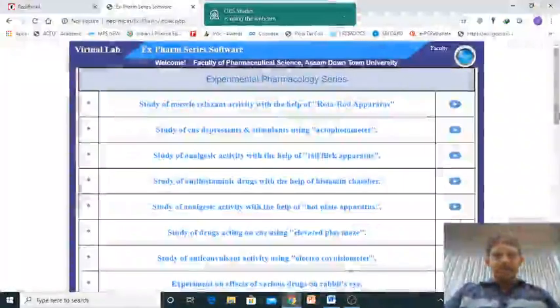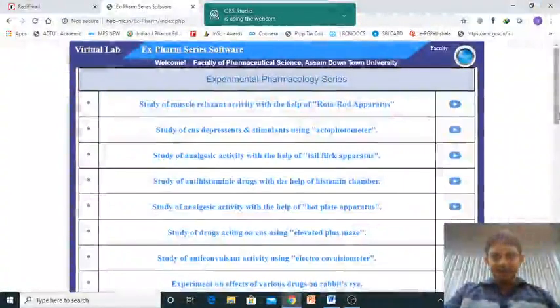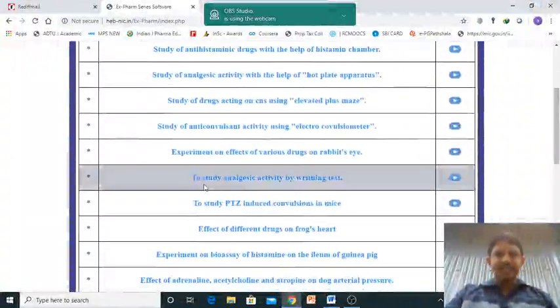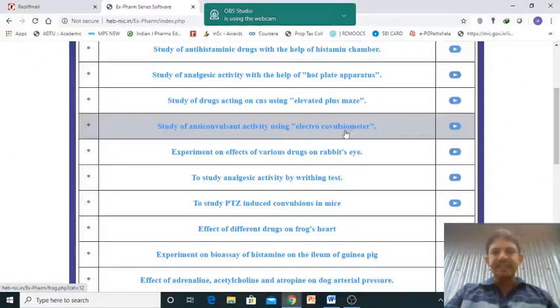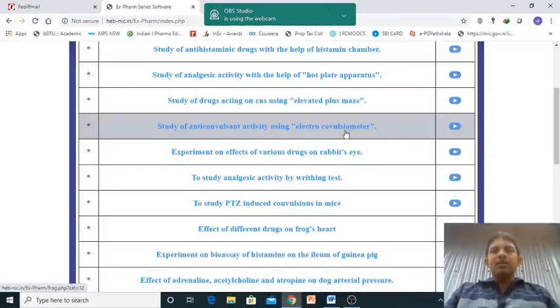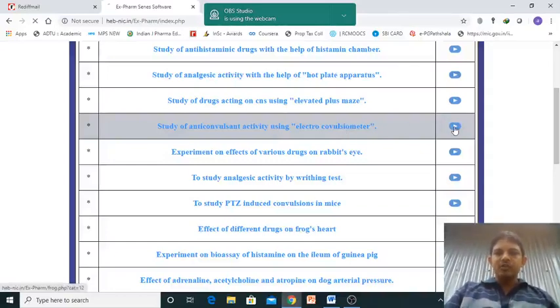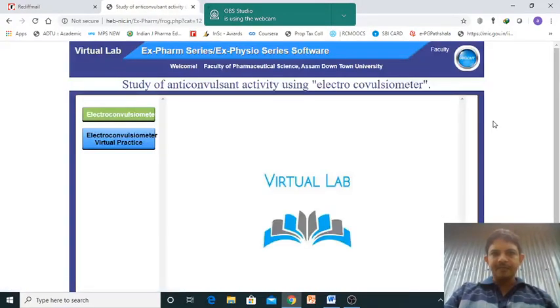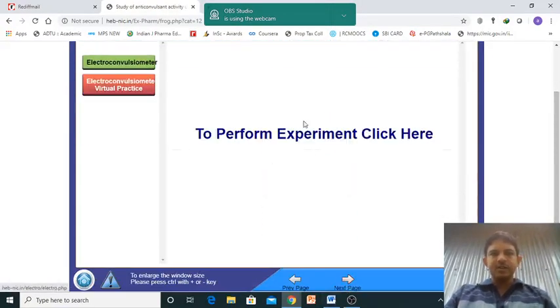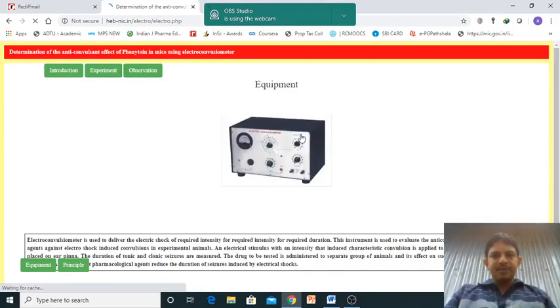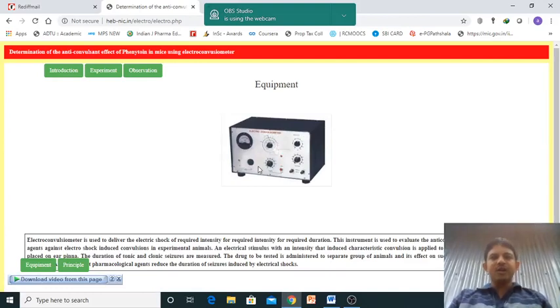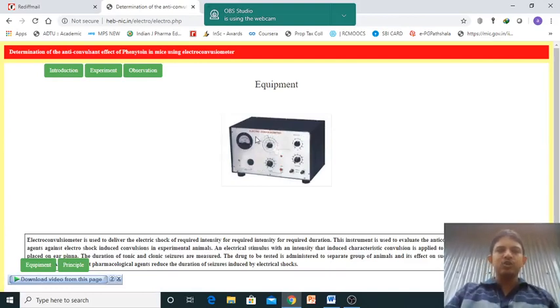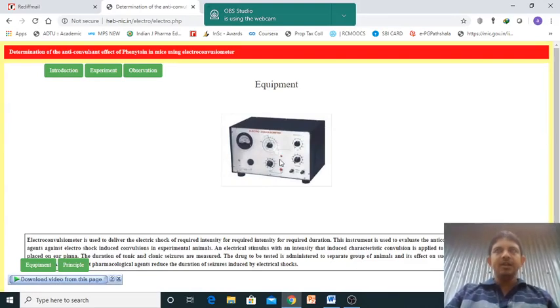Good morning. Today we are going to see the next experiment - the study of anti-convulsant activity using electroconvulsometer. For this experiment, we need to enter the next page and click into the experiment. This is the equipment which you have seen in our lab also, the electroconvulsometer.